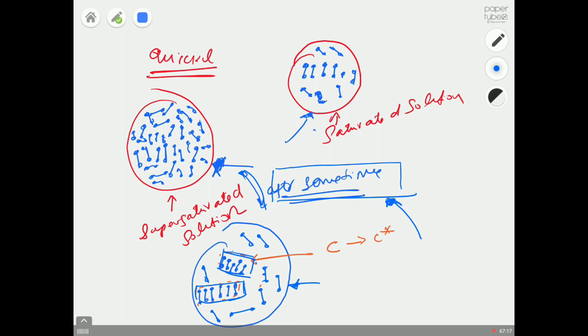There is a technical term for this time. We call it the lag time. Many researchers call it the induction time. During this induction time, all the molecules in your supersaturated solution try to meet each other, recognize each other, and realize how to fit with each other, and then they will come together. They might even form something like clusters. Some people call it an intermediate phase.